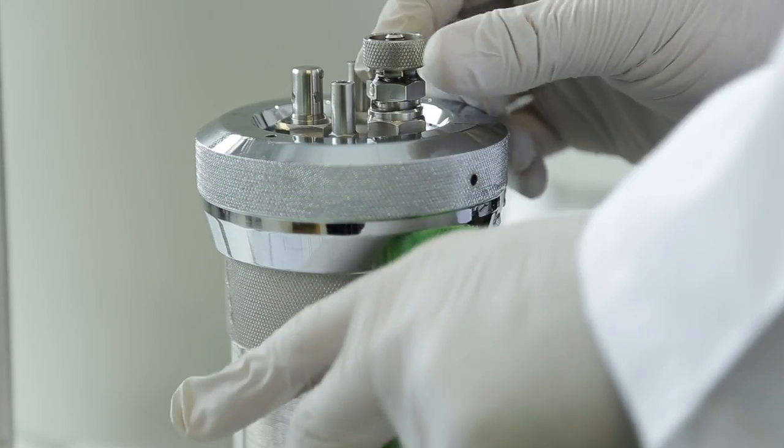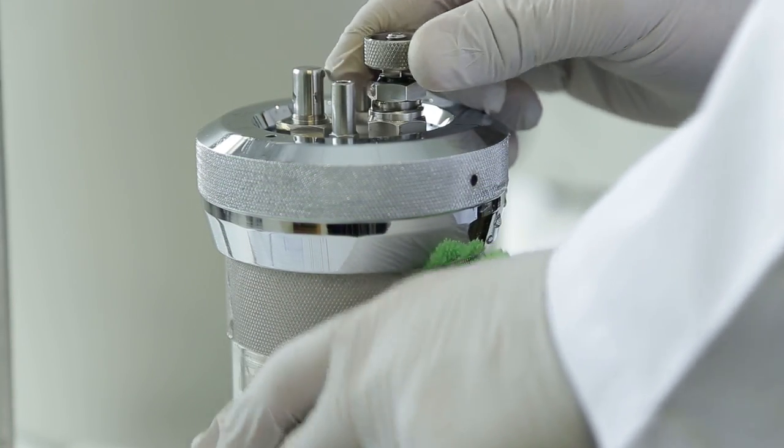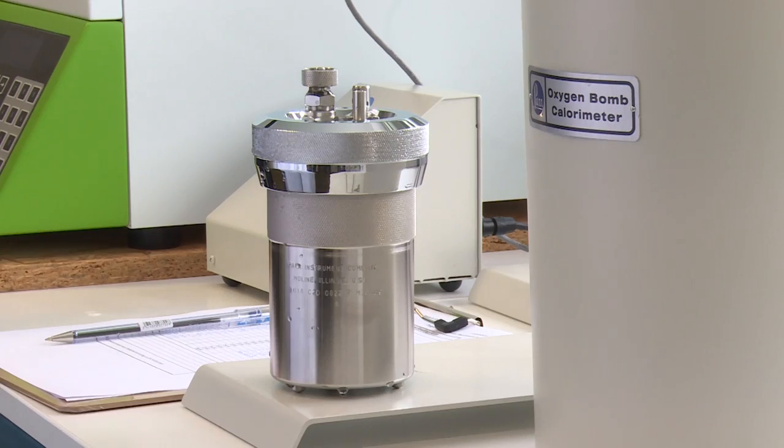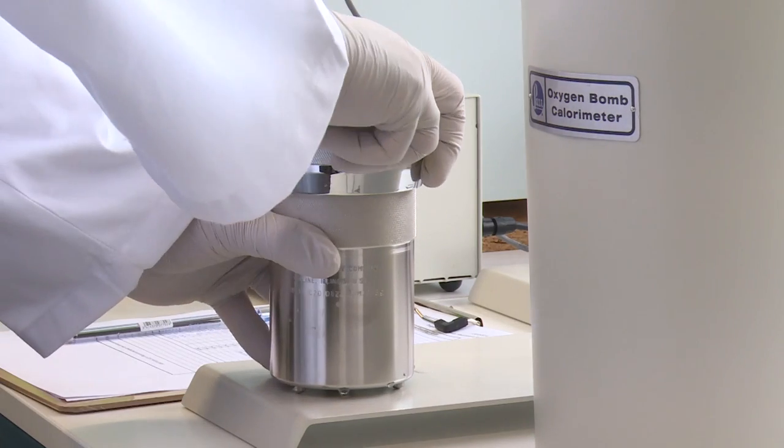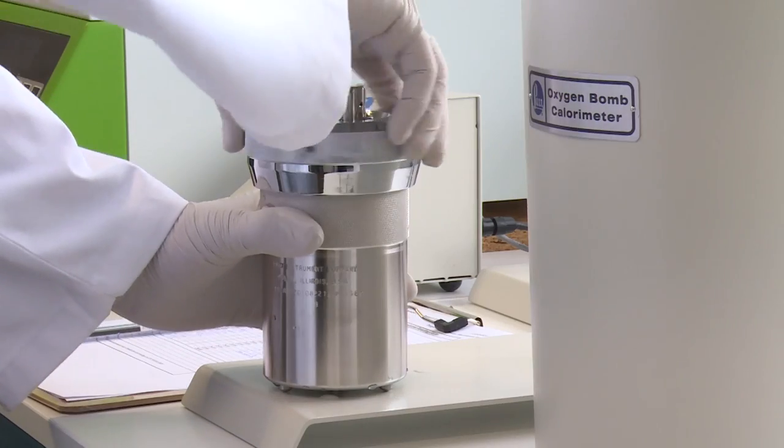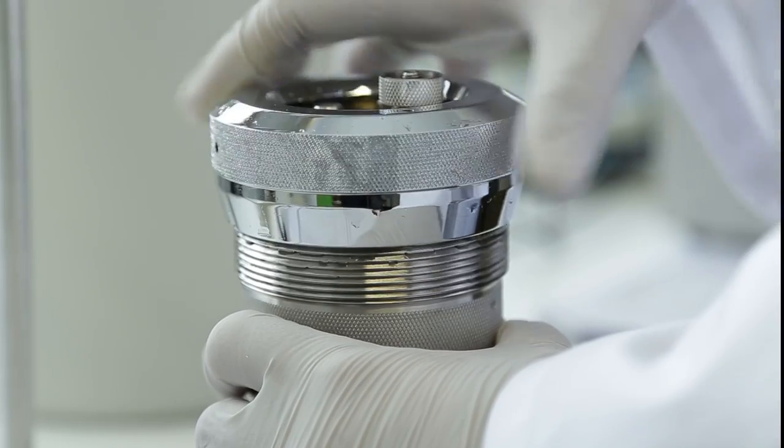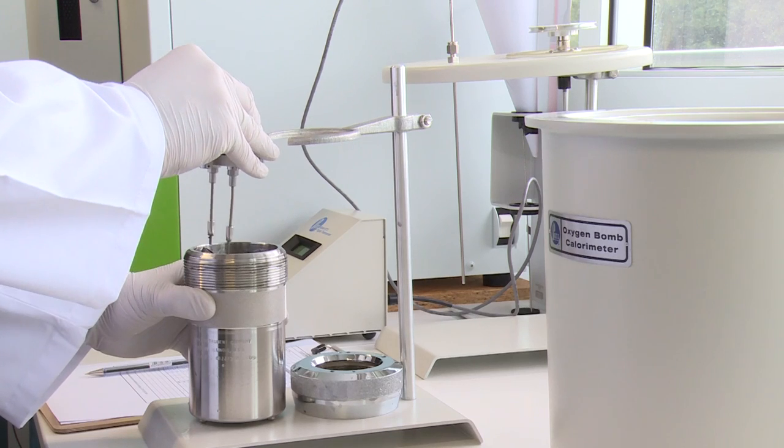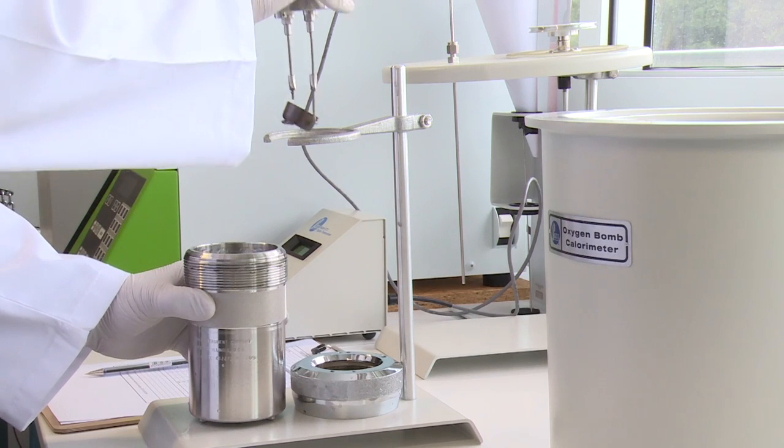Open gradually the knurled knob on the bomb head to release the gas pressure before attempting to remove the cap. After all pressure has been released, unscrew the cap. Lift the head out of the cylinder and place it on the support stand. Examine the interior of the bomb for soot or other evidence of incomplete combustion.